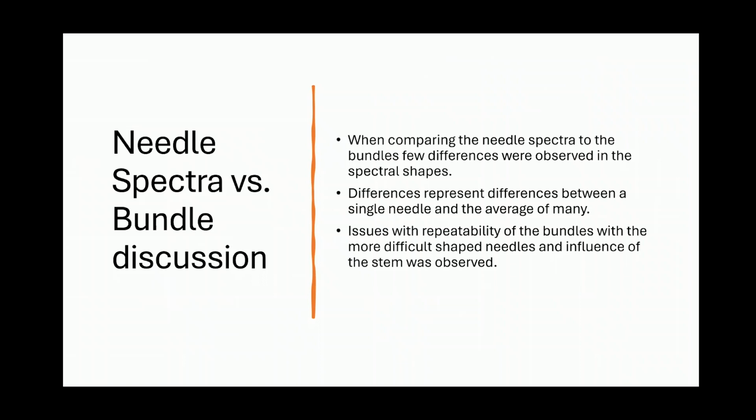And in some of the spectra for the bundled, you could see the influence of the stem. So by removing that, we're able to overcome that influence, bringing more accurate measurements to the field. And we're also able to overcome the repeatability issues of having bundled pine needles that are very difficult to keep in the same place and take repeated measurements.